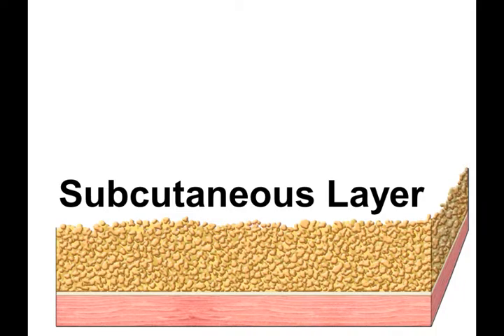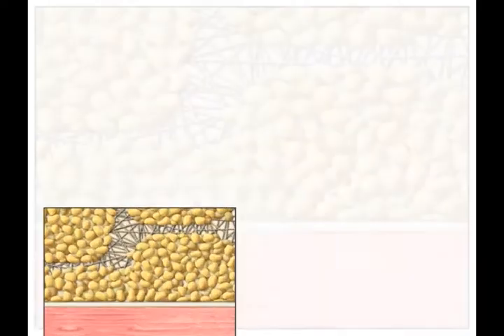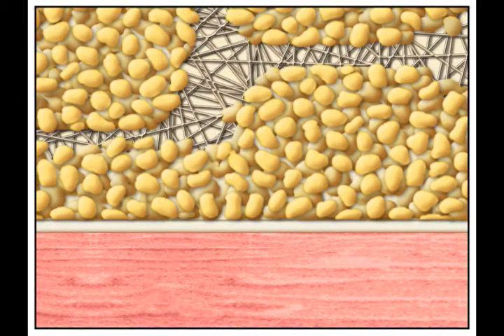The subcutaneous layer is composed of lipocytes divided by septae, with the blood vessels present within the septal structures. Higher power shows the septae in between the lobules of lipocytes.